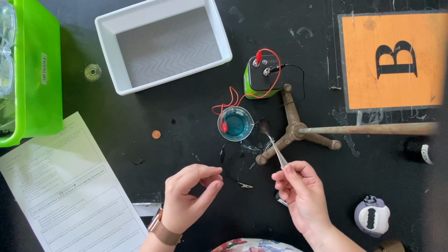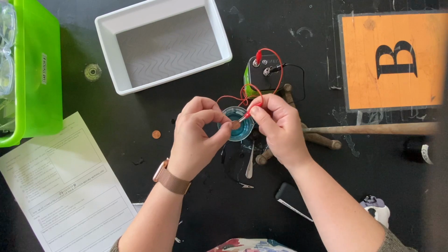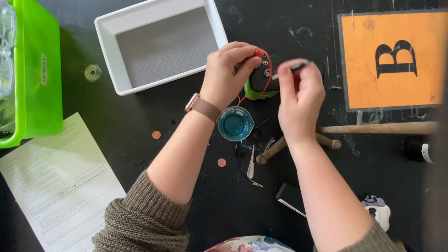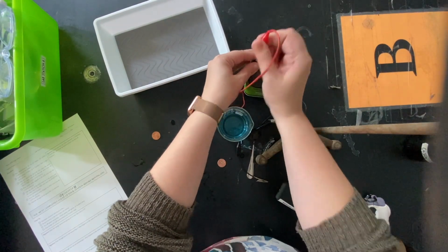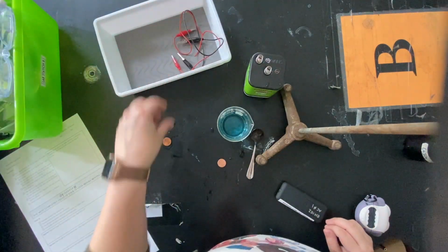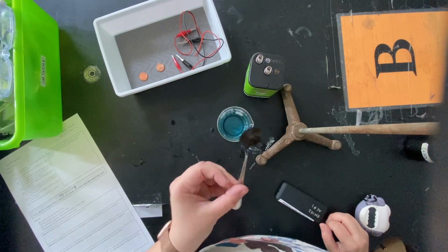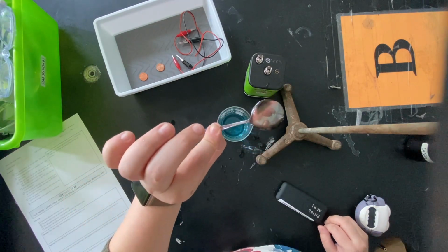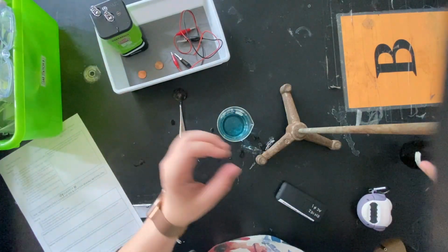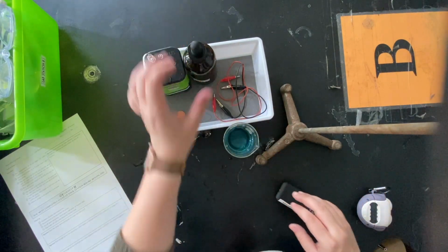So once you are done, we're going to clean up the lab. So cleaning up involves taking off your penny and unhooking your spoon, unhooking both of your electrodes from your battery. Everything gets put back into your bin. You can dry off your pennies if you need to. The spoon, whatever your teacher says to do with your spoon is what you should do. Battery goes back in. Your copper sulfate solution goes back in.